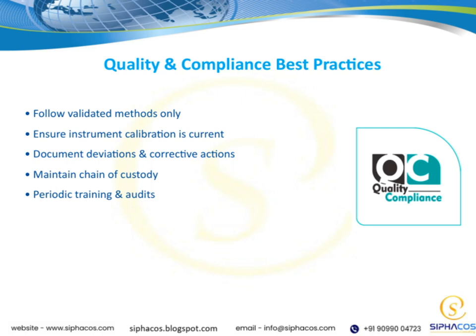Lastly, periodic training and audits are essential. Regular training keeps everyone up to speed on best practices, and audits help us verify that we're consistently following them. All of these practices together support our overall goal of maintaining high quality and compliance standards in our work.